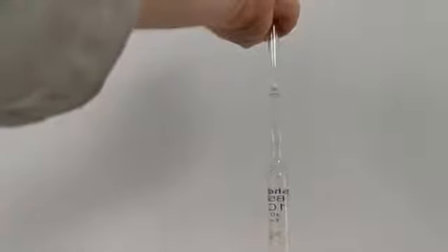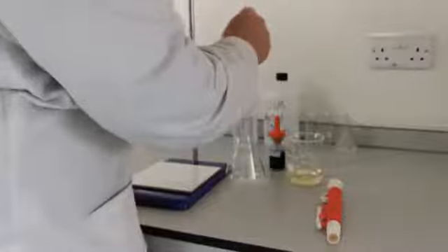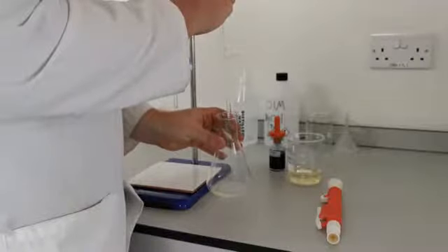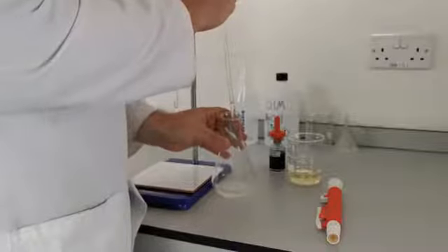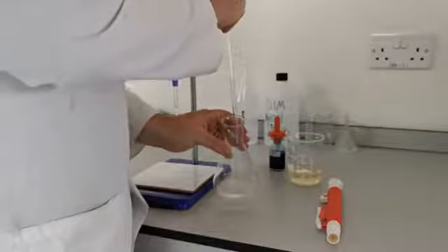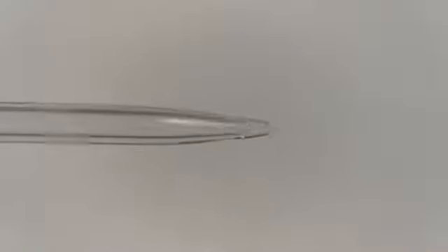Let's do this. Dispense your sample into the conical flask by simply allowing the pipette to drain into it. You'll notice that a very small amount of the sample will remain in the pipette. This is perfectly normal.